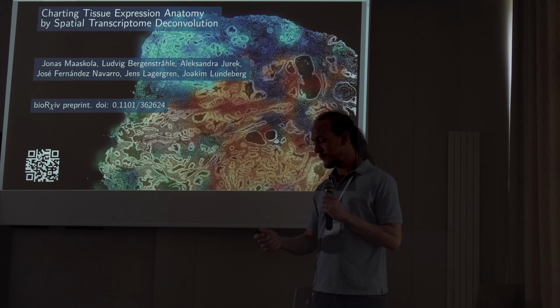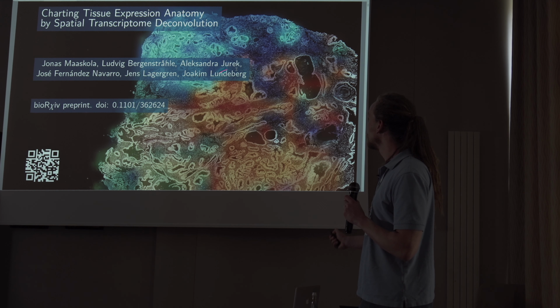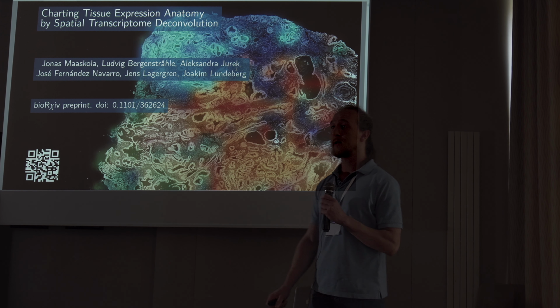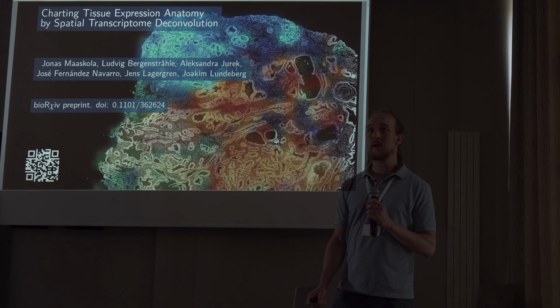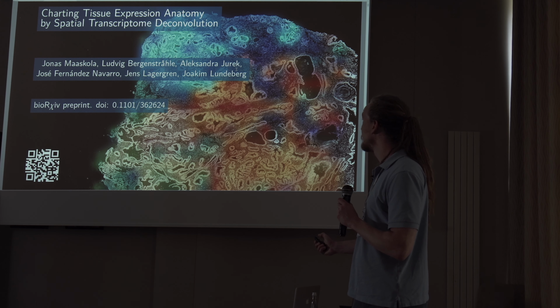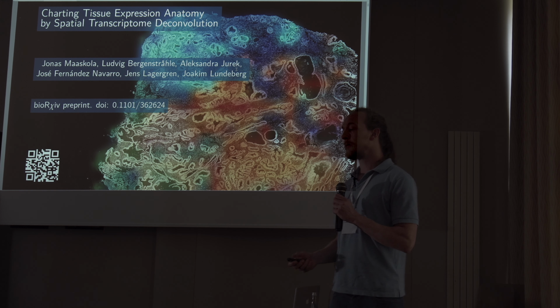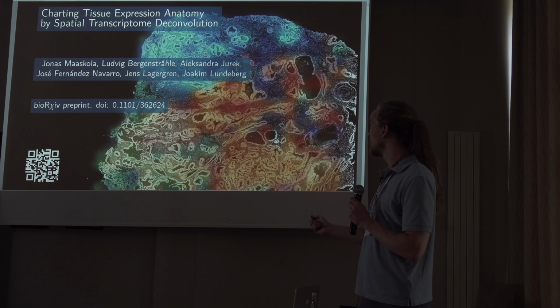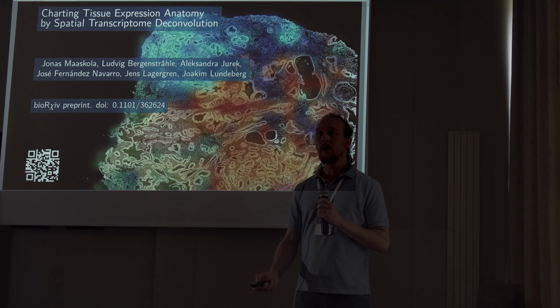However, since we're here right now, I want to point out that this bluish region up here is what our transcriptomics data picked up as some kind of interesting region. And according to the pathologist, a smaller region to the center of this is a solid tumor, indicating that our technology picked up this larger region, including a disconnected region over here. So that was fairly interesting.